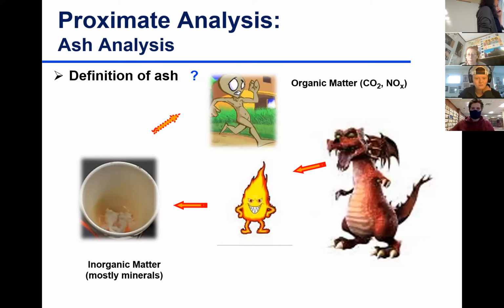The color of the ash is really dependent on the original substance that you have. If you look at your ash and it's really, really dark in color, you might think that it's incomplete ashing, due to either the furnace temperature being low, or the time not being enough, or it's a really tough matrix to burn off. But sometimes even if you do everything you can, you don't end up with a really nice white color.